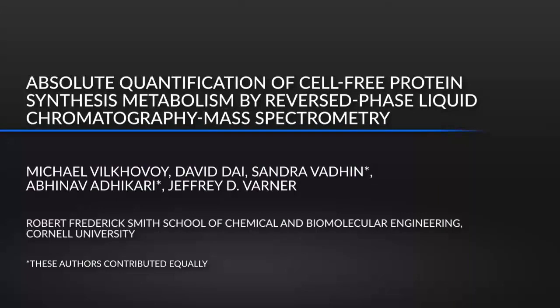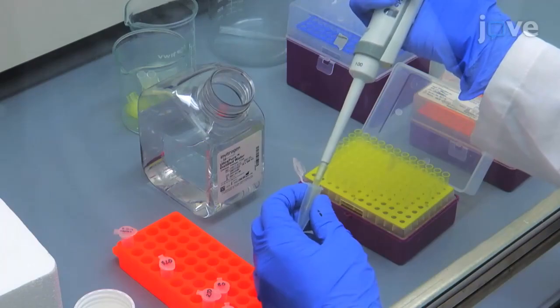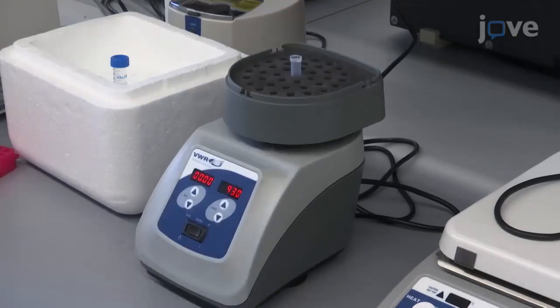Cell-free protein synthesis is an emerging technology in systems and synthetic biology for the in vitro production of proteins. Cell-free protein synthesis systems have no cell wall, thus we have direct access to metabolites. In this protocol, we quantify the absolute measurements of 40 metabolites involved in central carbon and energy metabolism, which allows us to characterize cell-free metabolism.